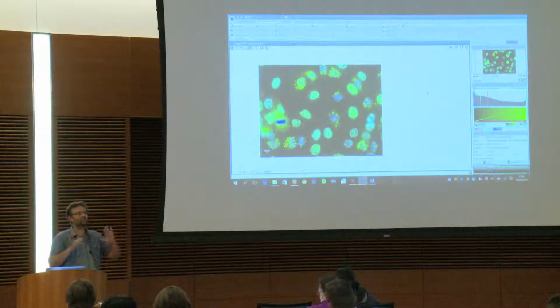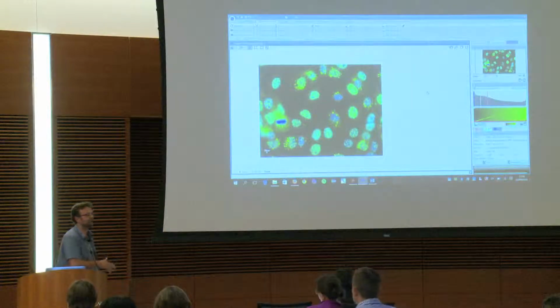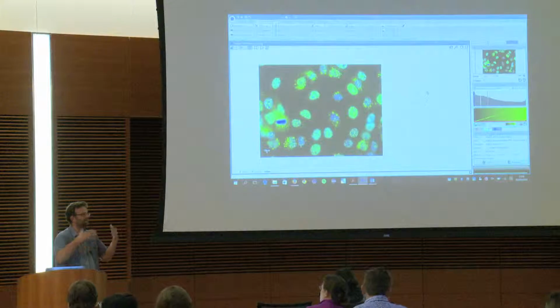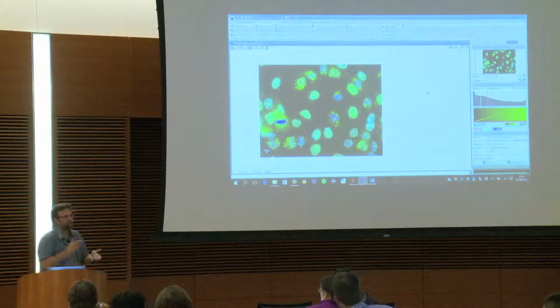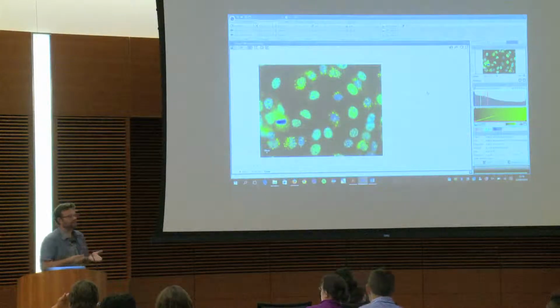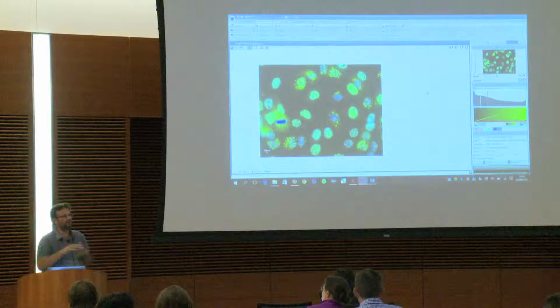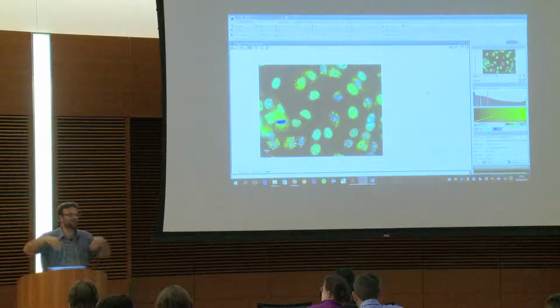As image analysts, we always have people coming with JPEG. And now, for the last 3 years, they are not coming anymore with JPEG because they understood that TIFF is great and you can still compress it, like with a zip file. So it's not a lossy compression. But there is a new problem coming now: people are providing images from the scanner. And for most of the scanners that I've seen, those images come back to JPEG because they are so big.